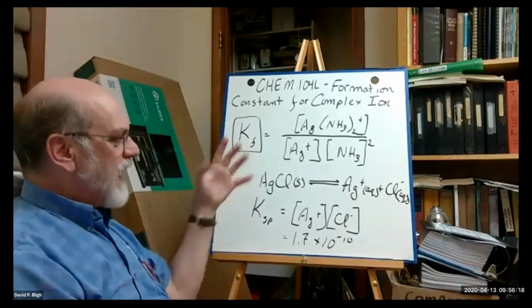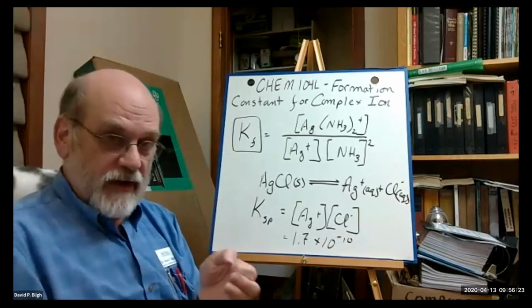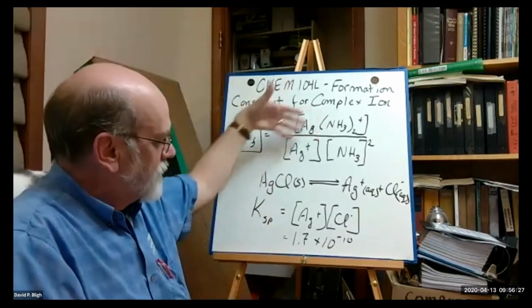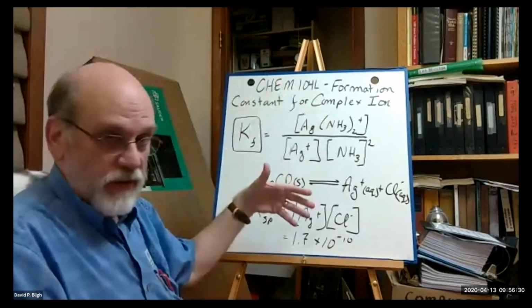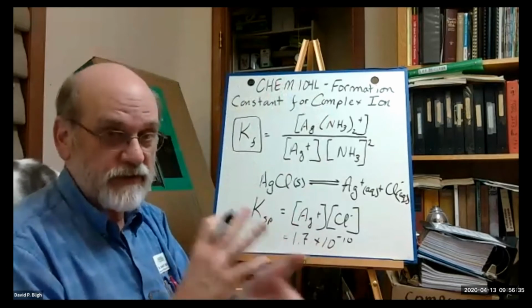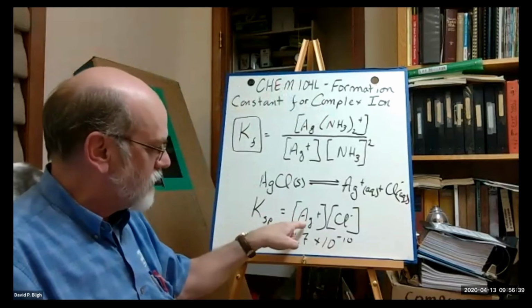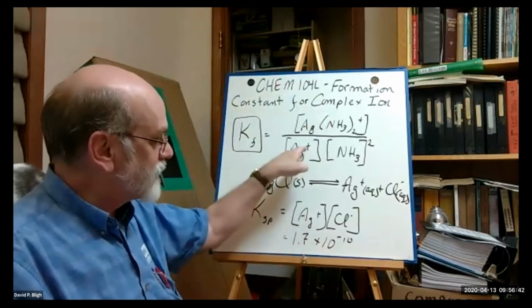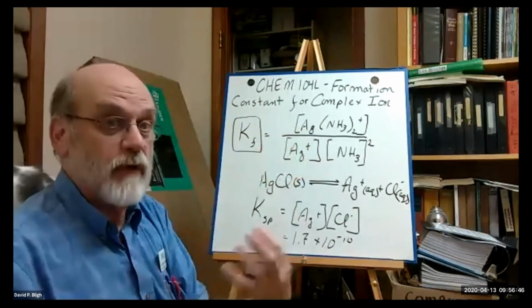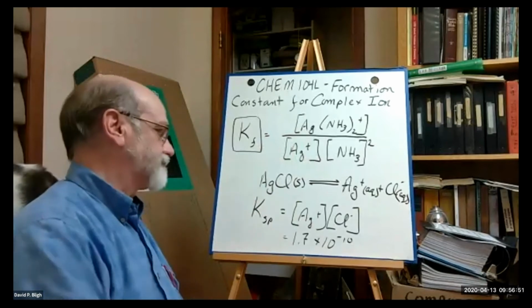So how are we going to combine these so that we can use this reaction? Well, the first thing you have to recognize is that if you add these components together with these components, they're both in the same neighborhood, so they have opportunities to interact. So whenever this concentration down here is known, it's the same concentration as that one. Why? Because they're in the same neighborhood. They're in the same Erlenmeyer flask in our case.